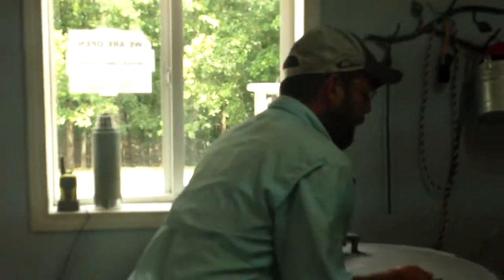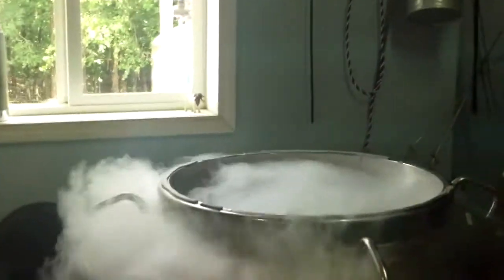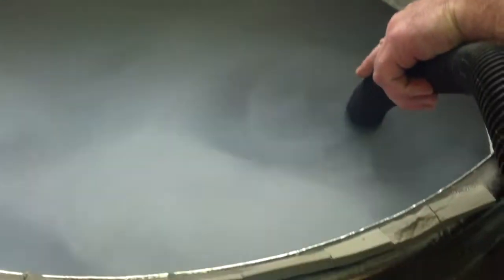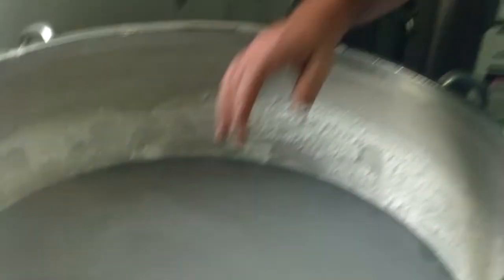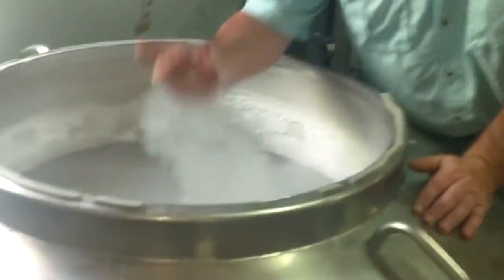This is one of our latest tanks. We'll be getting another one before too long. This one will hold somewhere around 35,000 units. You can see there's liquid down here in the bottom, but again it's emitting as a gas as it's coming off. It is very cold — it will burn you. I do deal with it a lot, so you can work with it very quickly, but I wouldn't keep my hands in it.